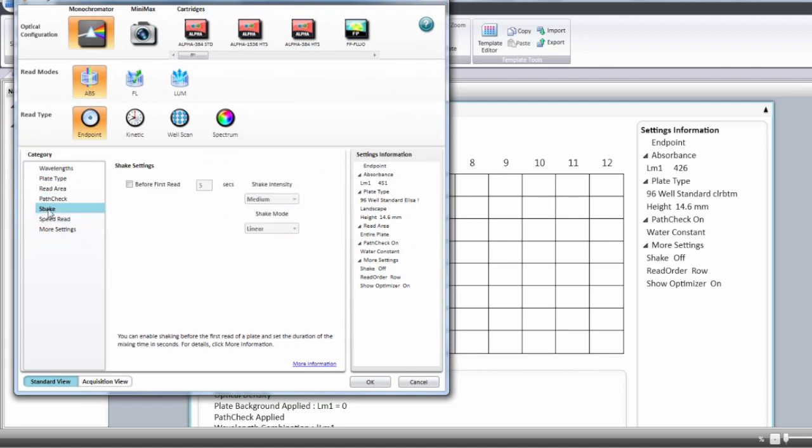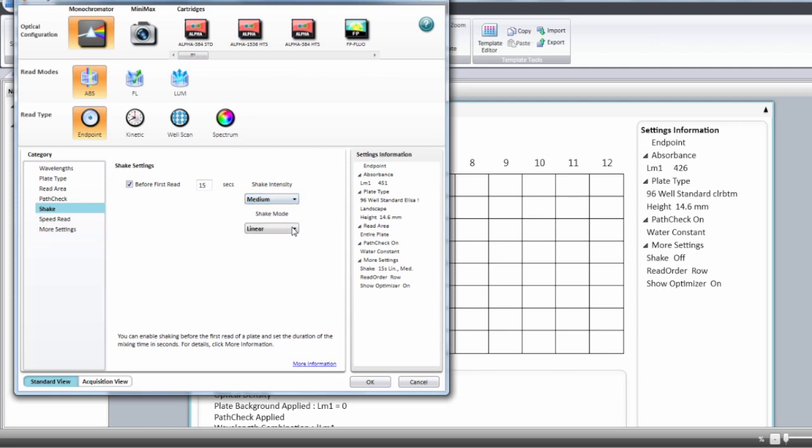Then you can select some shake options and you can check before the read. You can set the time for the shake. You can choose low, medium, or high shake and if you want linear or orbital.